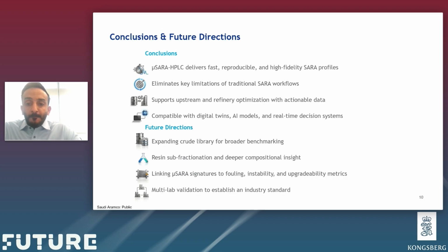Looking ahead, we're expanding our crude oil libraries, especially for our operations in the subsurface, to develop broader SARA benchmarks. In our case, we're trying to build these libraries to predict the crude oil origin or crude oil type.